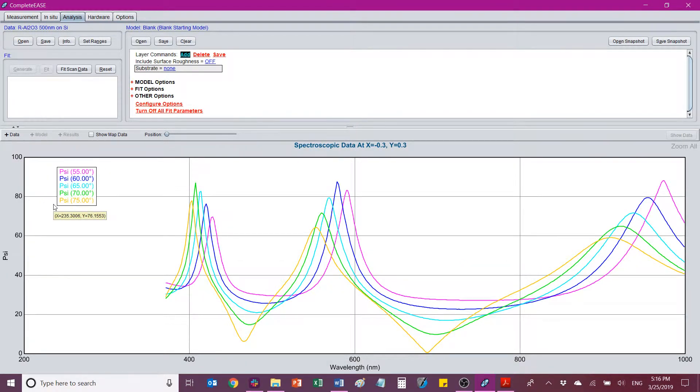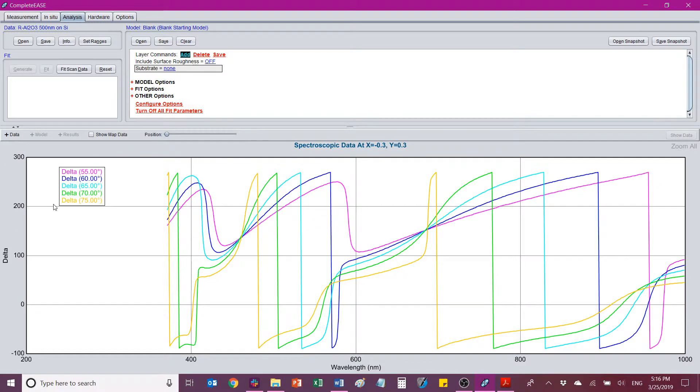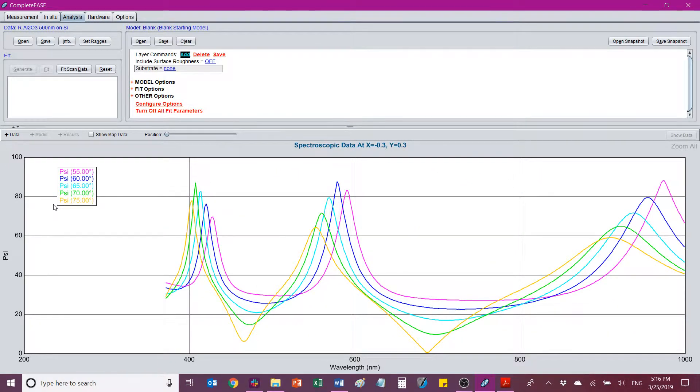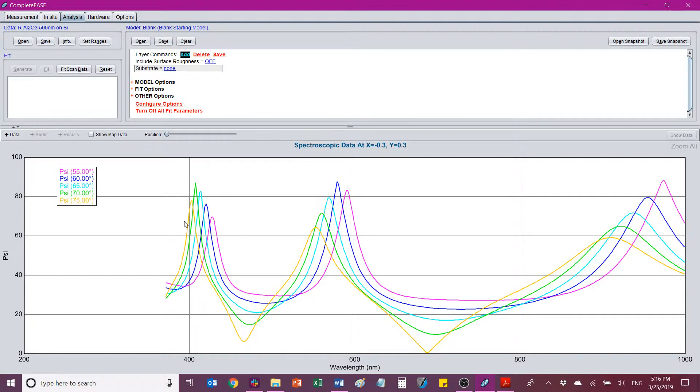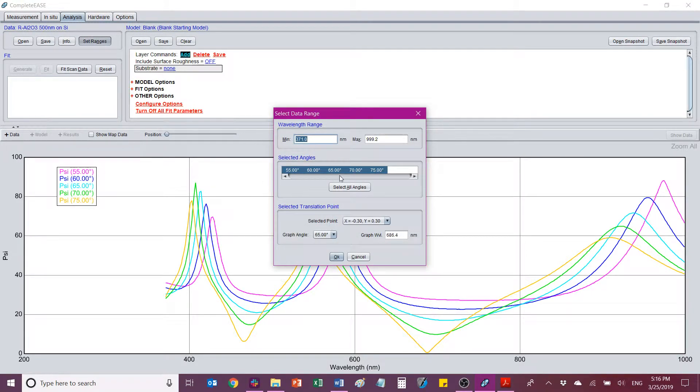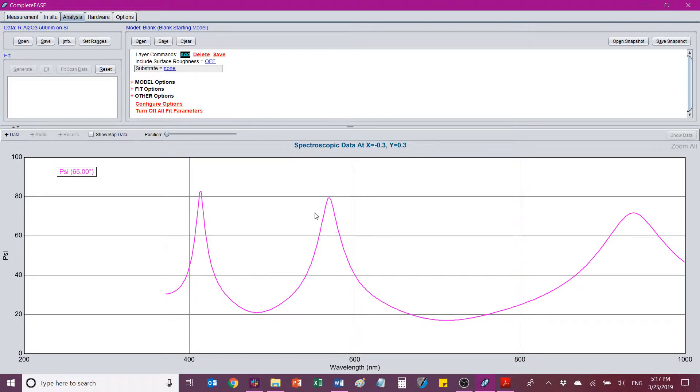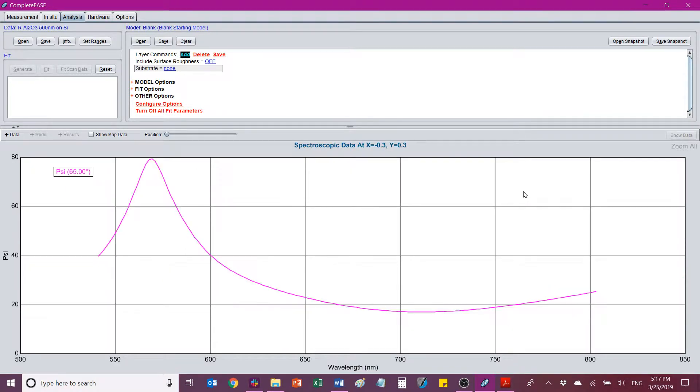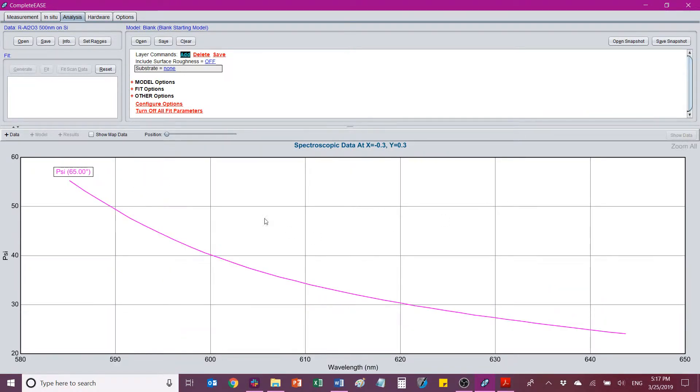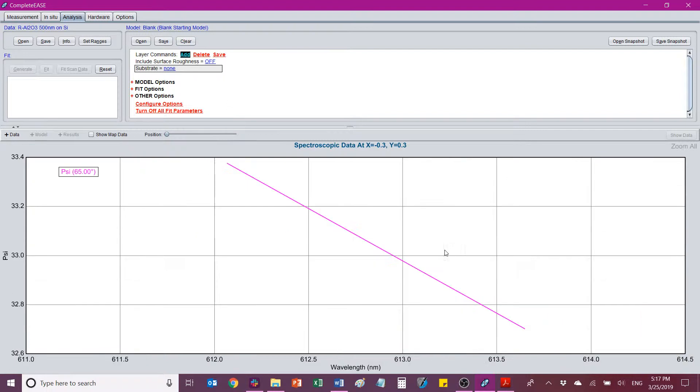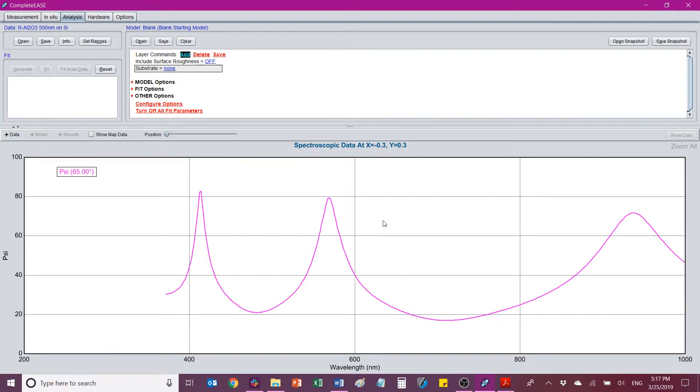So now that I have my data file open, if I don't want to necessarily work with all this data at one time, I can go to Set Ranges. And I can, for example, just choose 65 degrees, let's say. And now I'm just looking at the data for 65 degrees. From that same window, I can also omit some of the wavelength information in order to do that. I can also just left click and drag to select a range and then let go and it will zoom in on that range. And I can zoom in further and further and further and just double click to bring yourself right back to seeing the full range.